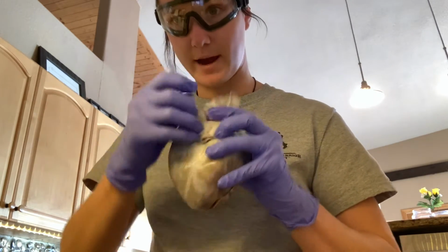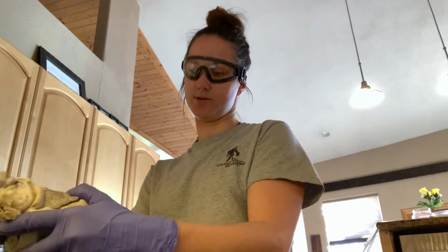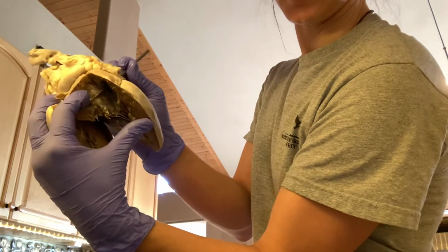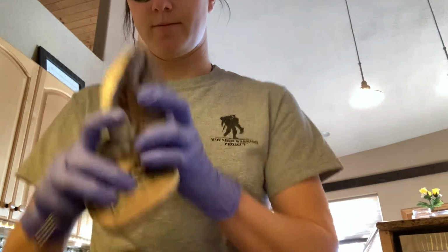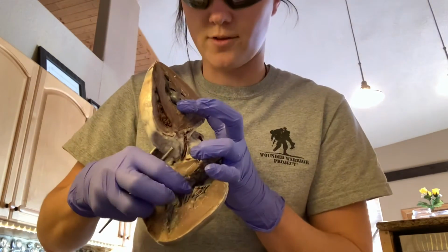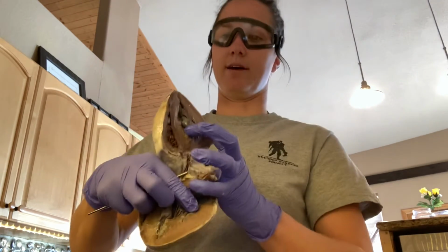Now the blood will get pumped back through here, and as I stick my probe into this part of the heart, we end up in the left atrium. And then the left atrium pumps into the left ventricle, just like so. And this valve here is the mitral valve, also known as the bicuspid valve, and it separates the left atrium from the left ventricle.